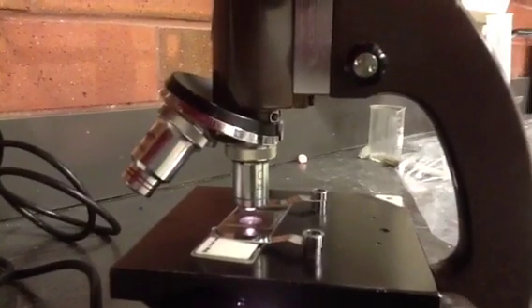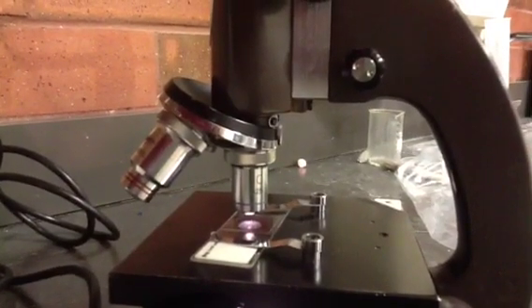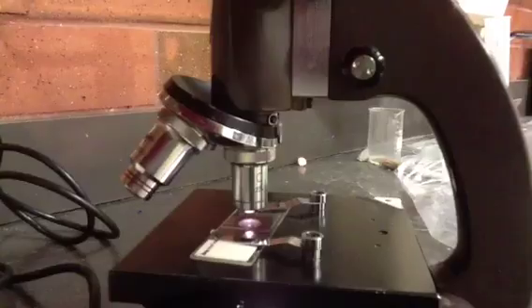You may need to do some slight focusing at this power as well, but it shouldn't need too much if you focused it thoroughly on the low power. This image is showing frog's blood at the lowest setting. Using the objective lens, which has a 4 power, times the ocular lens, which has a 10 power, gives you a total power of 40 times magnification. At this setting, you don't see a lot of detail, but you see the whole image.